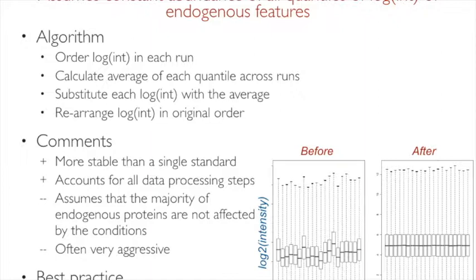Well, yeah, I was more interested in mean versus median. Oh, that. Yeah, the mean will be more affected by a single outlier. Oh, yeah, of course. So the median is much more robust to a single protein which can be jumping up and down. So the center of the distribution will be much more stable. So we don't use the mean. In a large data set, it shouldn't matter that much, right? If the distribution is symmetric.